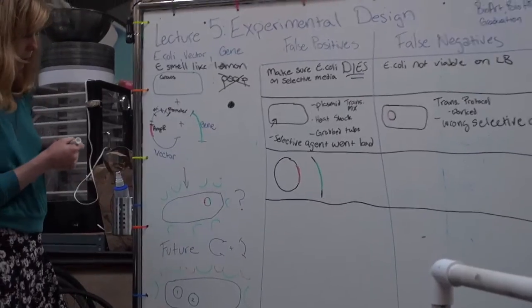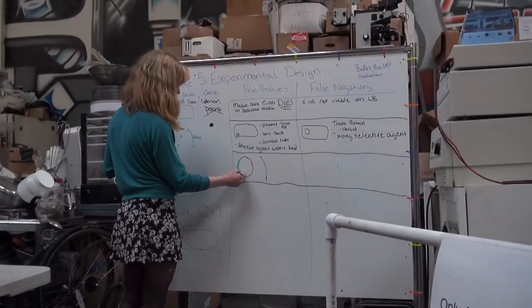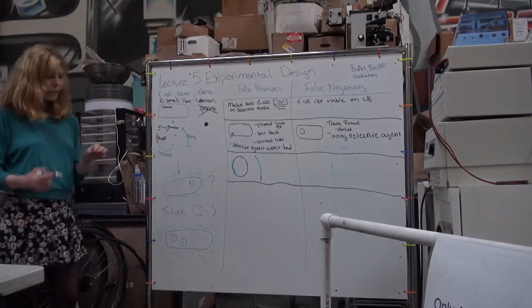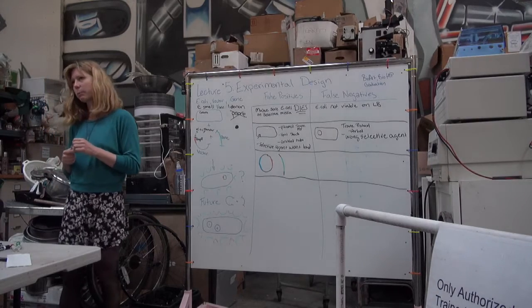All right. So one of the things that I like to get in my plasmids is having a differential marker, and I'm marking this one blue because it's for the LacZ gene, and that's for beta-galactosidase.